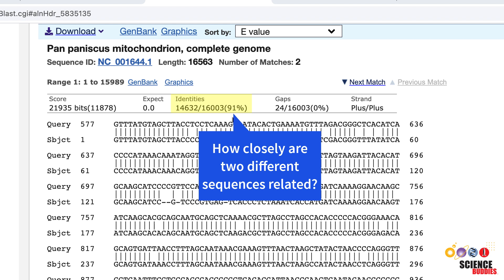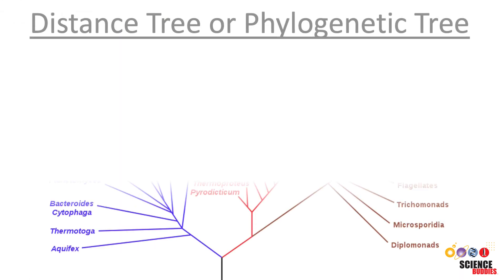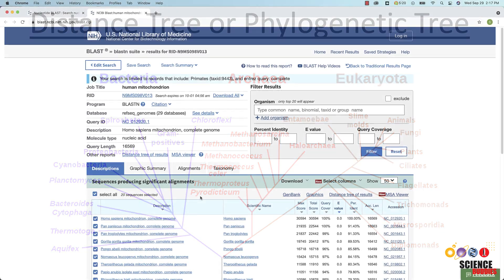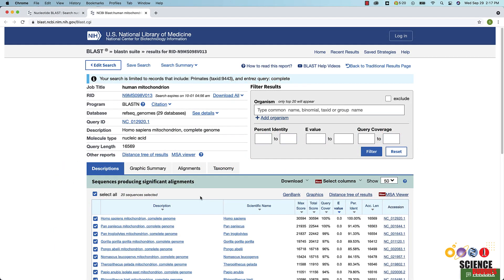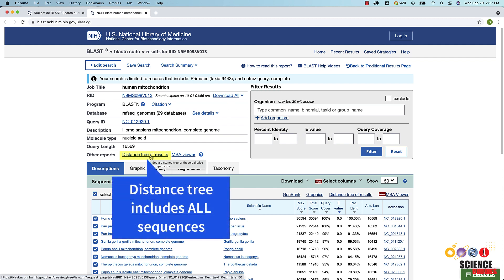You can depict the relationship among database sequences and the query sequence in a distance tree or phylogenetic tree. In the summary section above the results table, there is a distance tree of results link. Clicking the link will generate a distance tree for all sequences in your results table.